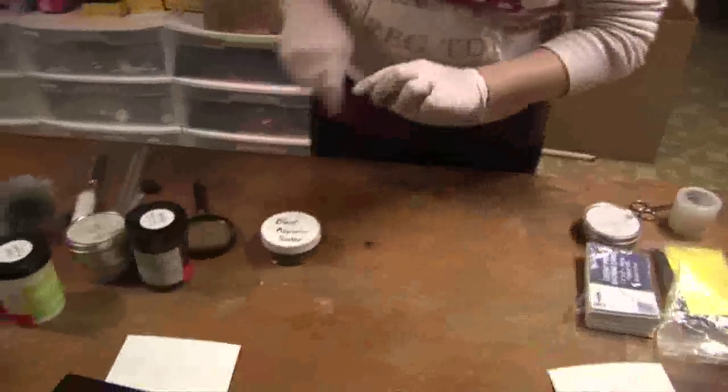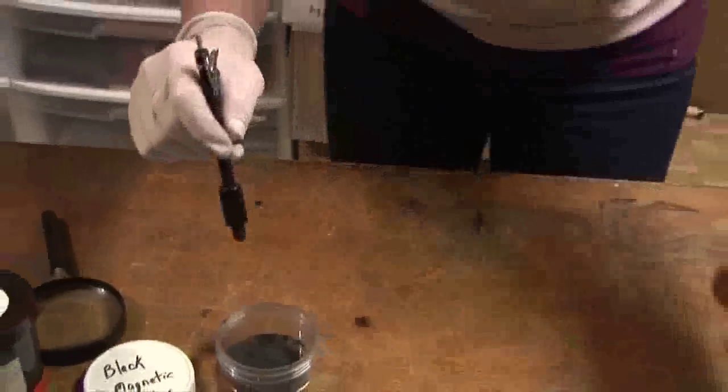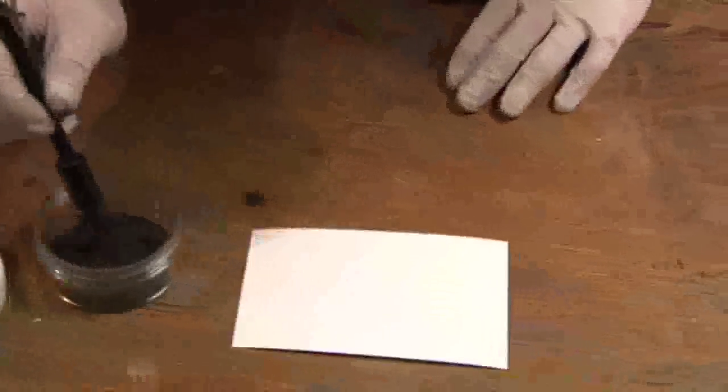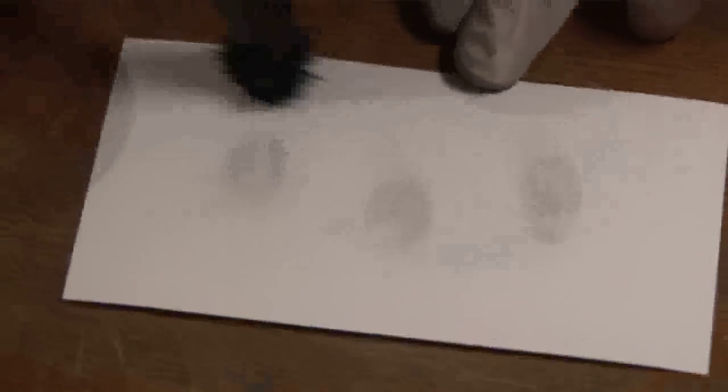Finally, we're going to move on to magnetic powder. Magnetic powder comes in all different kinds of colors, but I'm going to use black right now. Magnetic powder has its own special brush — when you dip the brush into the powder, you can see it kind of hangs on like that. To remove the powder, you pull up on this, which releases the magnet and all the powder comes off. Magnetic powder is cool because the brush never touches the print, so you don't have to worry about it distorting them at all. It's also really easy to clean up after.